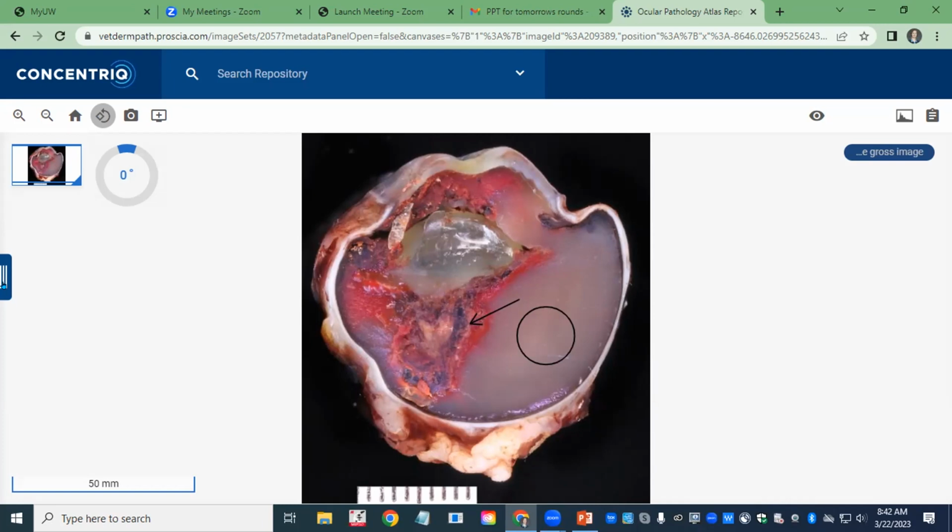My sense would be that it's like any other densely proteinaceous fluid. Like you see in FIP, where you've got the densely proteinaceous fluid inside of the body cavity. You know how you drop that into acetic acid and then it gels and congeals? Formalin's also an acid, so my assumption is that when you put it into the acid, it gels and congeals in the same way. Formalin would make fix things by creating bonds between proteins. So I think the protein rich content there, when you fix it in formalin, gels because the formalin creates bonds between the proteinaceous content of the fluid.